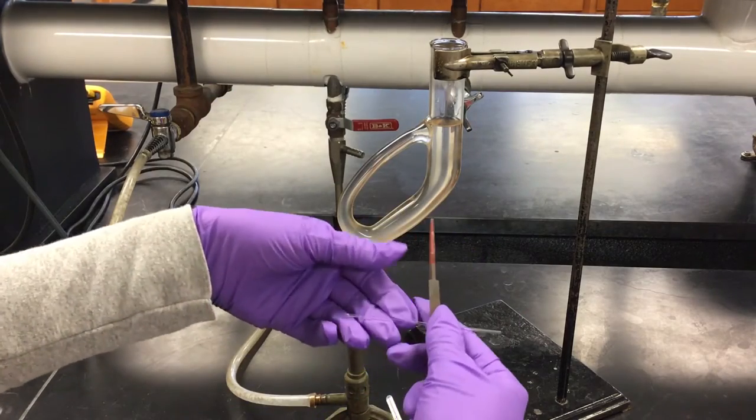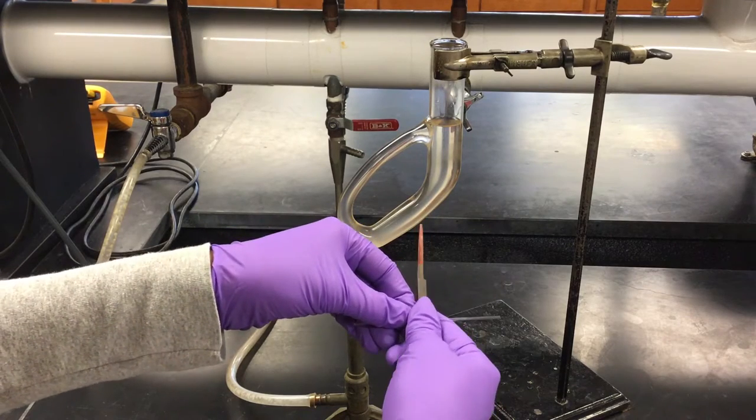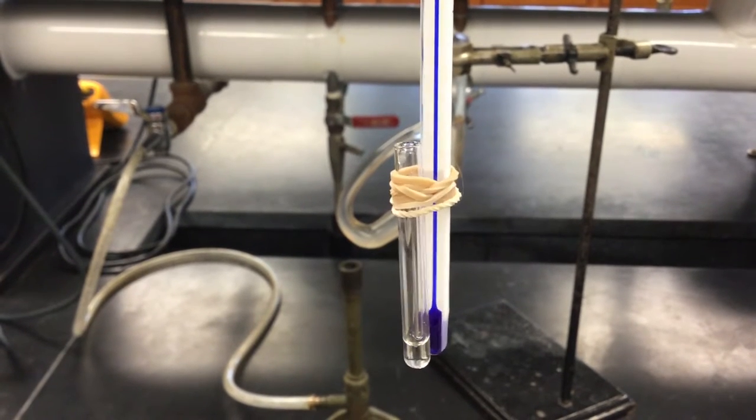Next, you'll need a short capillary tube. To do this, break a big one in half so that it fits inside the small test tube. Put about this much of your sample into the test tube with the short capillary tube.